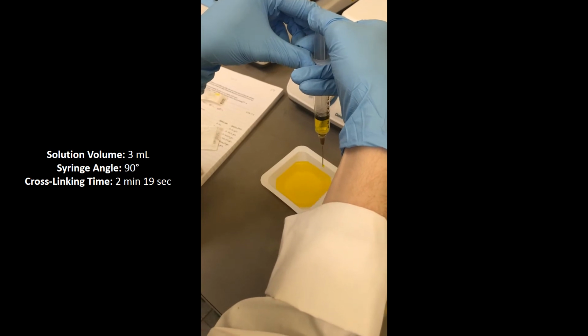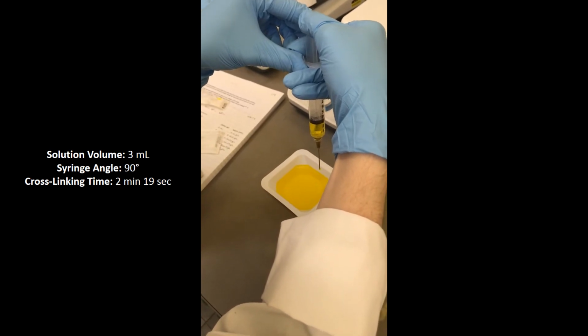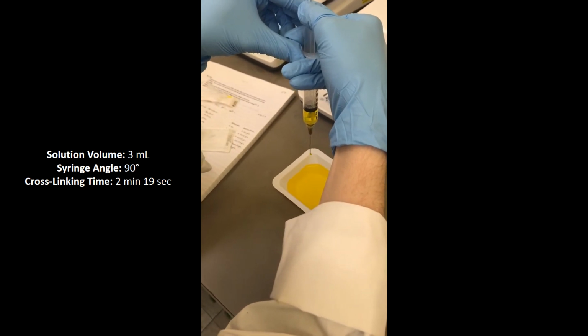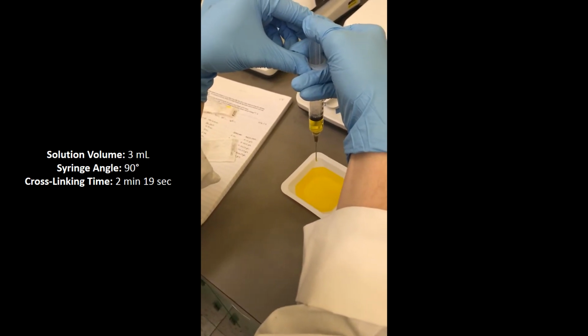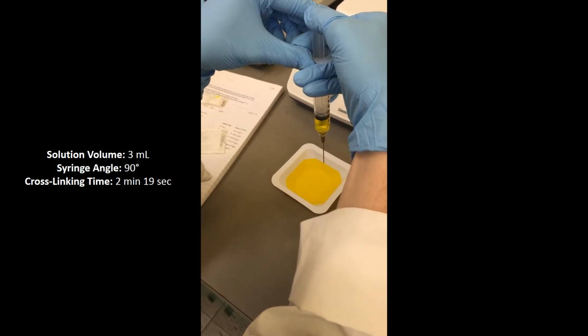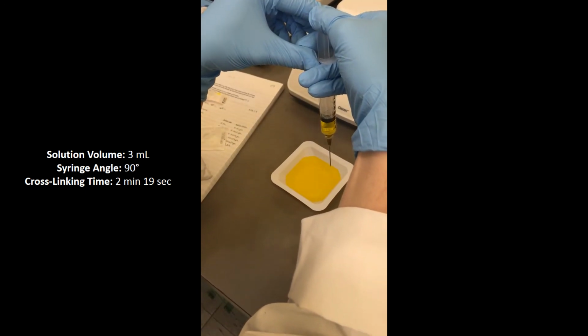3 milliliters of the alginate tartrazine solution were suctioned with a syringe of specified gauge. Droplets were introduced into the calcium chloride solution by freefall with a perpendicular syringe. They were allowed to polymerize for 2 minutes and 19 seconds.